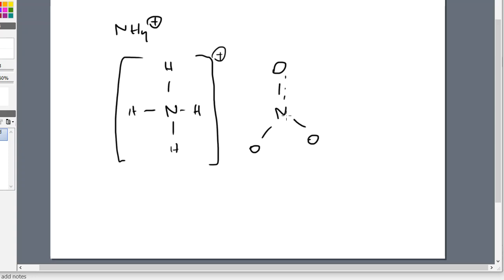We get a little bit of what we call hybridization, and that hybridization means electrons can move throughout the molecule. Not drastically important for this particular lecture or for this lab, but we do get some movement of electrons that stabilize that NO3 group a little bit more, actually, and then that carries a negative charge.